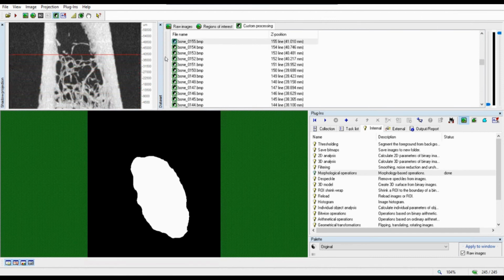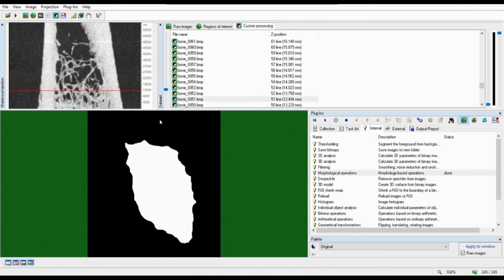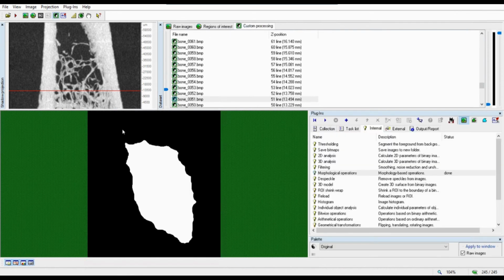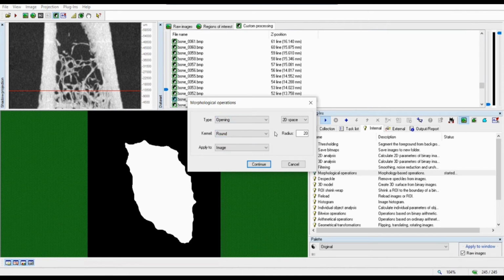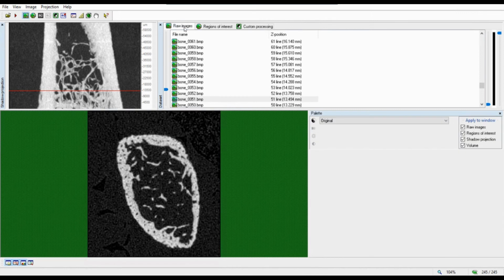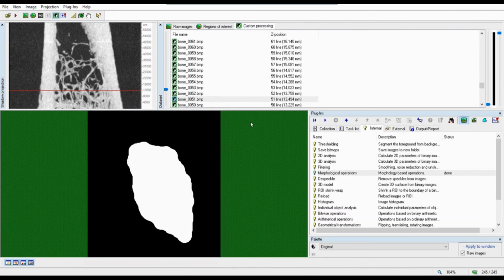It is okay. Yeah. So it's important to notice that we have created a lot of kind of spikes around my bone marrow region, and they are actually mostly due to some openings that you find in the cortical bone, but they are also not very nice. I don't want my region of interest to have this. And to smooth this, let me add this one. I can use the morphological operation doing the opposite, doing an opening, then I will remove an amount of pixels on the borders and then include again. So I will keep the same value. You can see how it's going to smooth, and now it looks more okay to the selection of the region of interest.